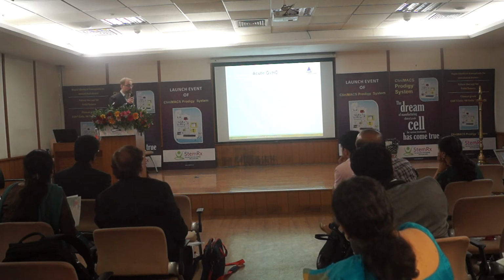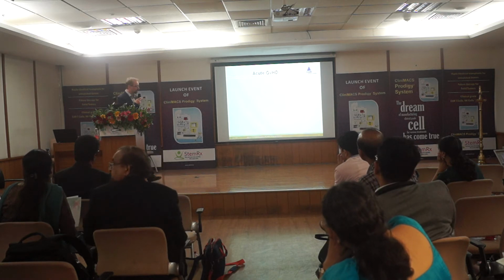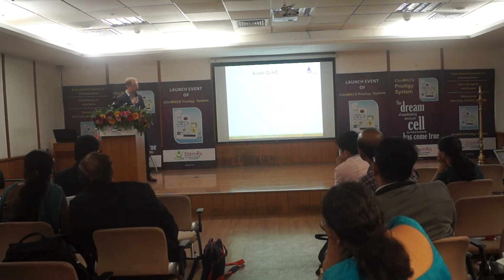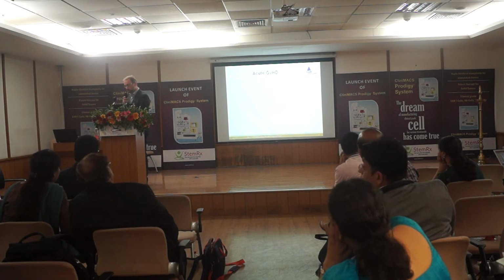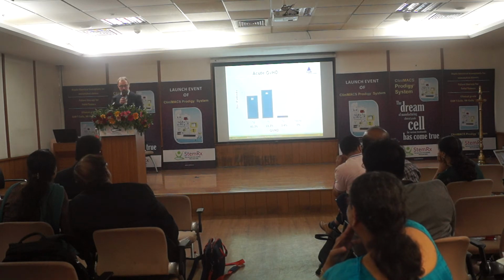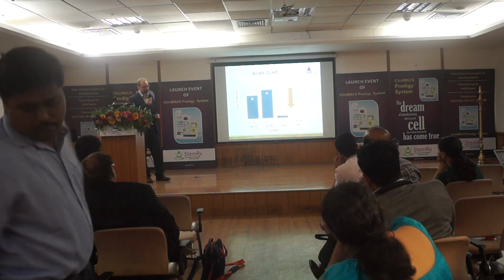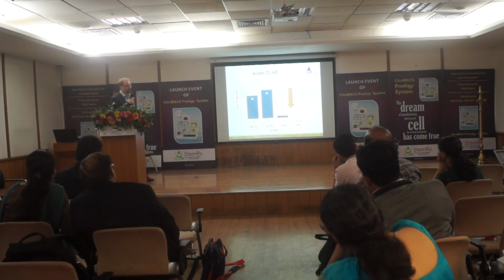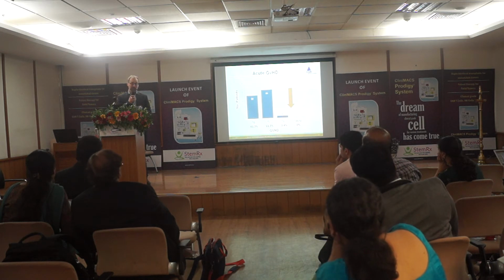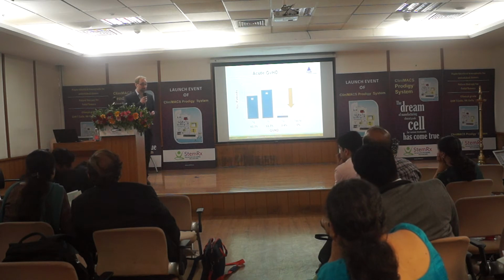So now it's getting interesting, how it looks in acute GVHD. We say quick engraftment, yes. We have a quick engraftment, so we can go forward with this. We confirm the data of the publications. Acute GVHD: our aim is reduced GVHD, and I think with no grade 3, 4, zero, we reach this, but it's only an outlook, only the first 100 days. We have to look at this data quite more, because now it's getting interesting what happens after these 100 days, because now we have to see what about chronic GVHD.